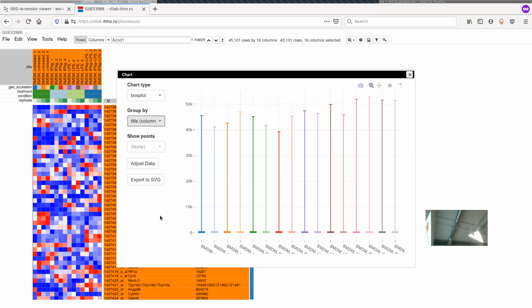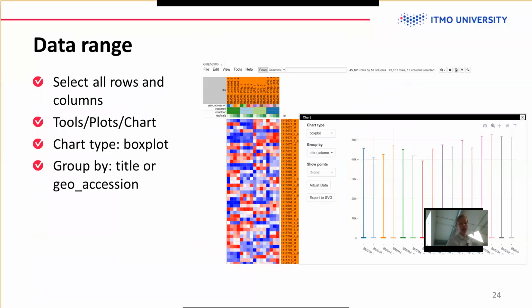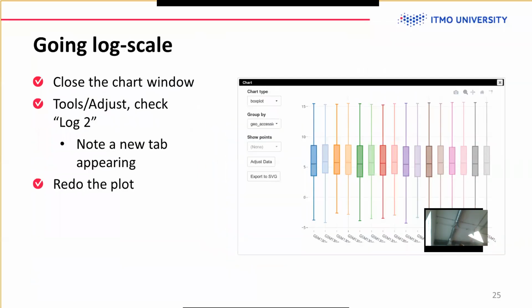So what you would like to do right now is apply a log scale transformation, coming from this big scale to a logarithmic scale, which will change models that have products in them into models that are linear and sums. After the log scale transformation, a twofold change will be a change by 1, for example, if you do a log-2 transformation.